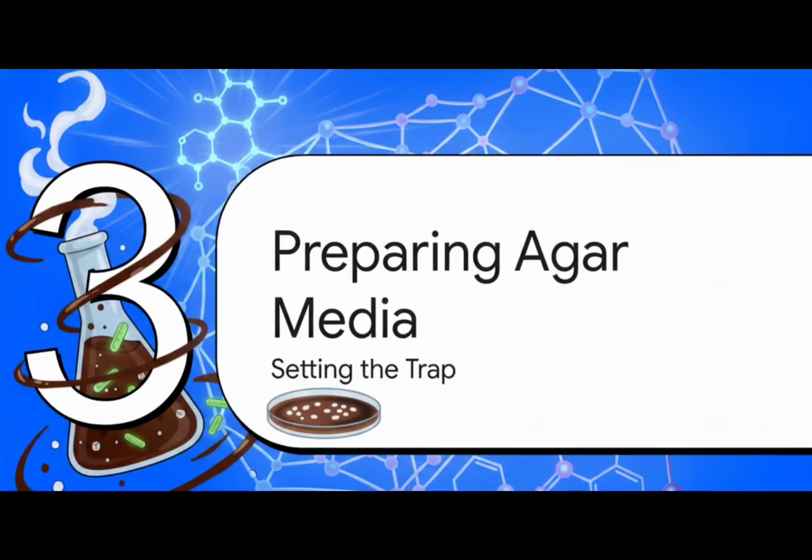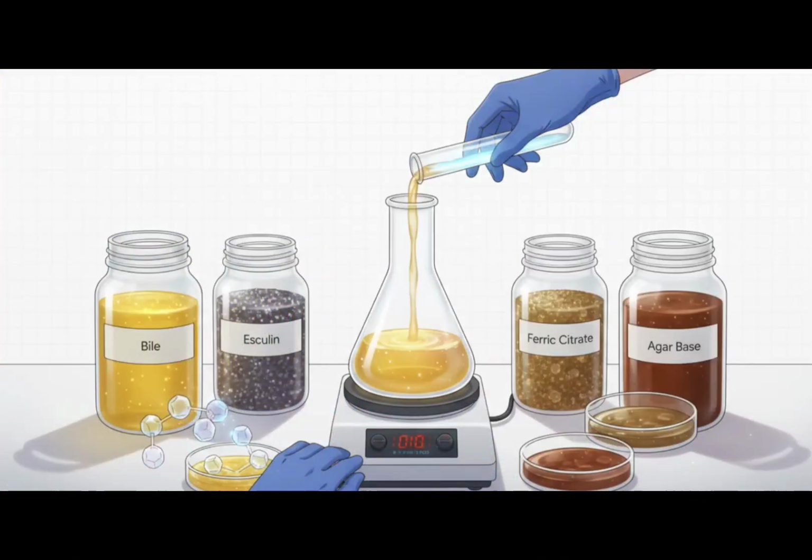Section 3. Preparing the agar media. Setting the chemical trap. You know, you can't just toss bacteria and esculin into a tube and expect a clean result. You really have to set up a series of chemical booby traps. Here are the key ingredients that make up the bile esculin agar. Obviously, we have our esculin, but the absolute most critical component is the ox bile. We're talking a brutal concentration of 40% bile or 4% bile salts.